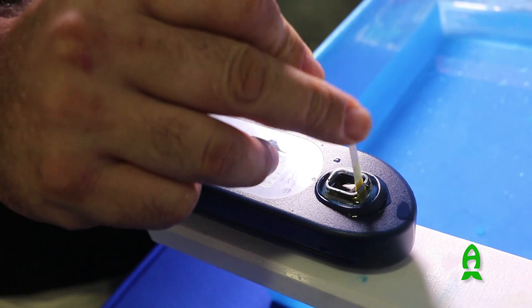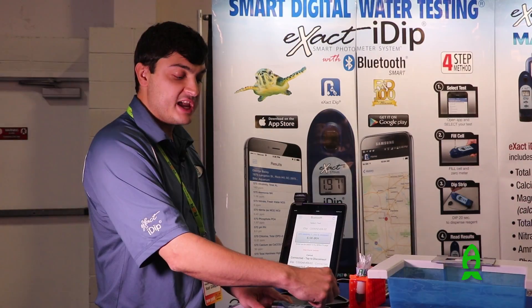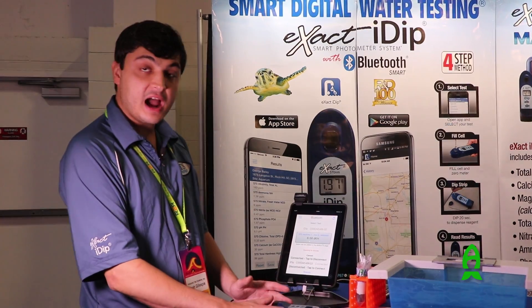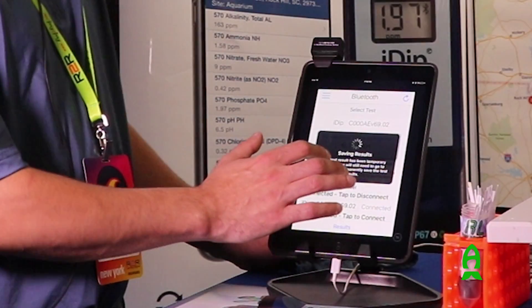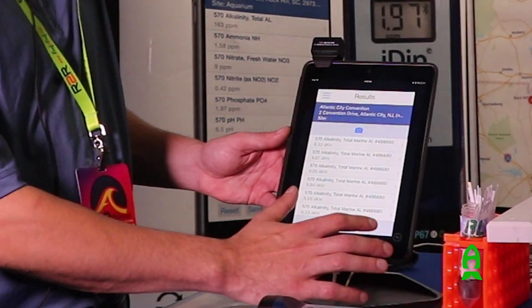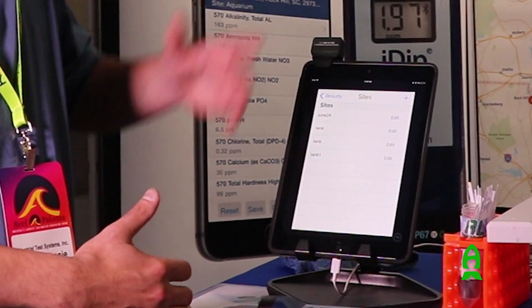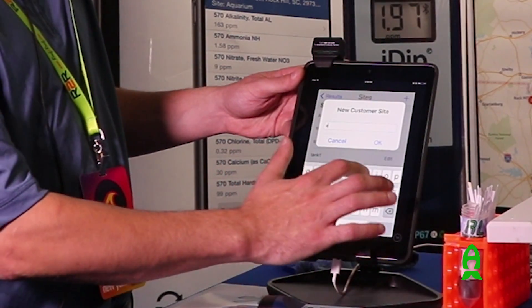The water changes color, and a light wavelength passes through the water to give you a digital output read. At one second remaining, you take your strip out. Your result is displayed on the screen of the photometer, as well as being sent to your smart device. Once you have your result, you can save it for months — if you test once a month, you can save it as the month you're testing, for example August.